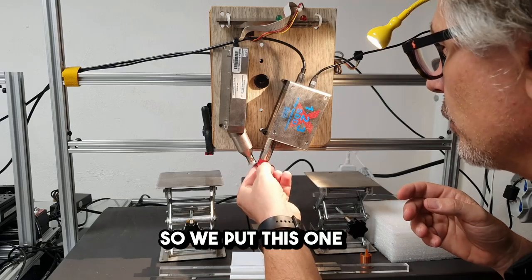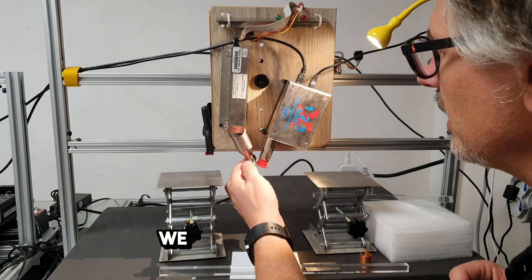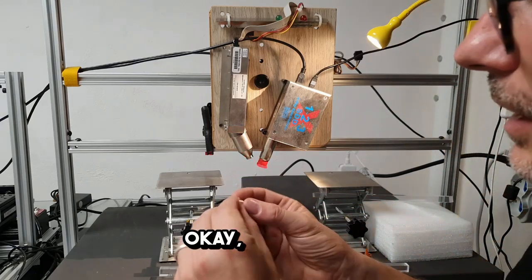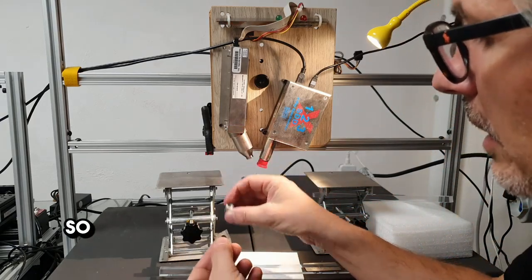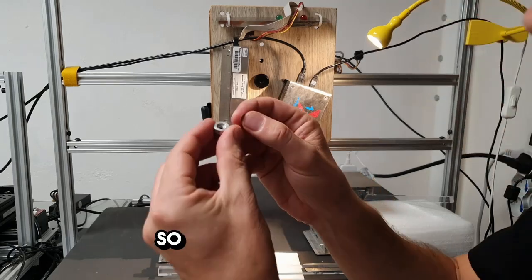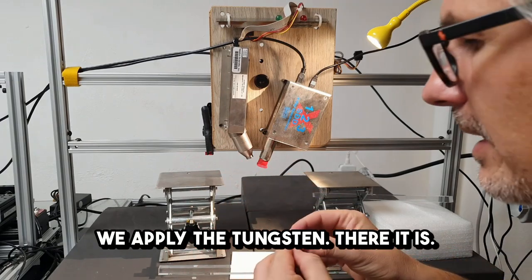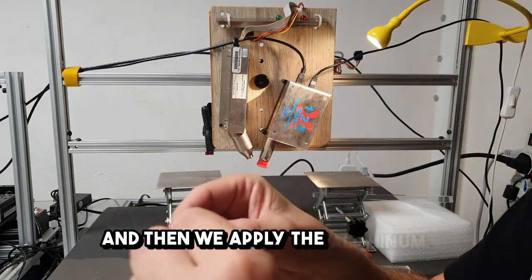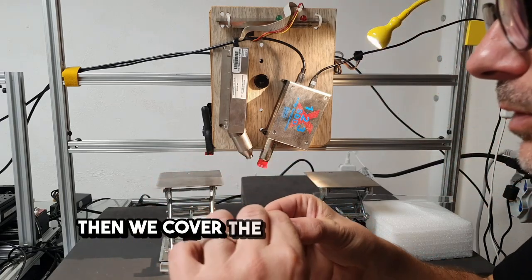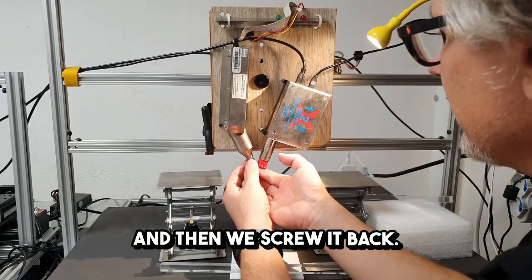So we put this one to prevent damage to the spectrometer. We unscrew this one. Okay, there it is. So the tungsten filter goes all the way inside. So it's the first filter we apply, the tungsten. There it is. And then we apply the aluminum. There it is. Then we cover with the tape, so they are in place, and then we screw it back.